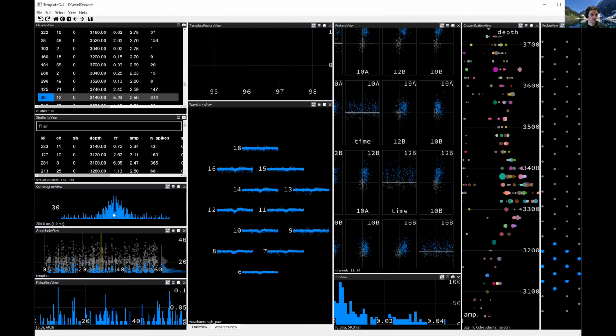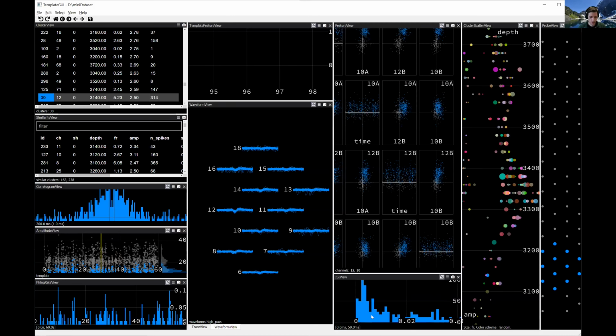And so if you see, like we do in this case, that there are some interspike intervals less than 2 milliseconds (this is 20 milliseconds, so 2 milliseconds is these first 2 bins down here), or in the Correlogram view, if you see that there's sort of fill in between these vertical bars, which are at 2 milliseconds, then you would be concerned that this neuron must have some false positive spikes, because a real neuron shouldn't have been able to spike that rapidly in succession.